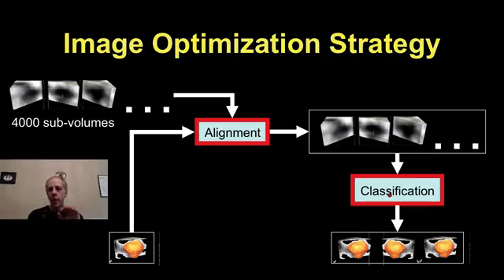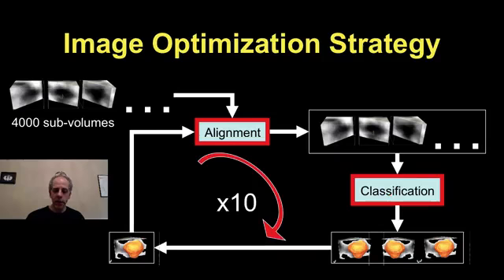Once you group, if you did everything right, you can basically average them. And we know that the average will reduce the noise. That's what we talked about before. We explained it when we were doing image denoising. So you can kind of denoise them a tiny bit. And after you denoise them a tiny bit, you can say, hey, let's try to align them again. Now they're a bit cleaner images. So we're going to align them again.